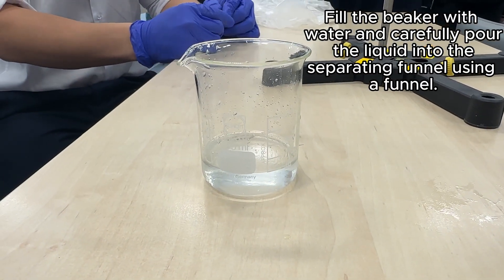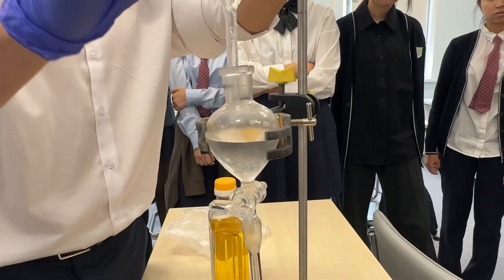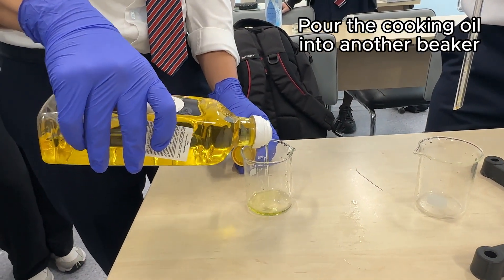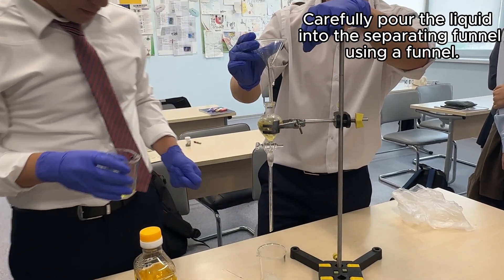Fill the beaker with water and carefully pour the liquid into the separating funnel using a funnel. Pour the cooking oil into another beaker and also carefully pour the liquid into the separating funnel using a funnel.